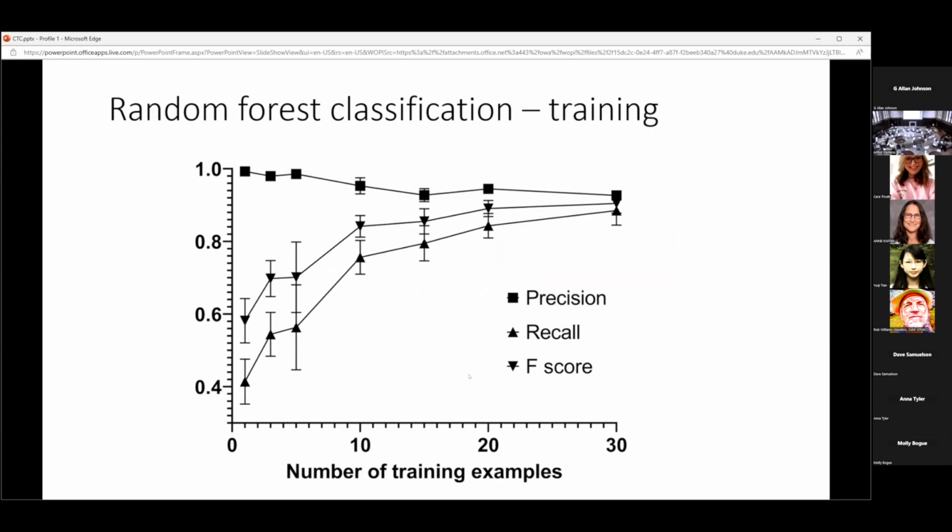As shown in this panel, when about 20 identified neurons are input to the training, the F score of the validation will be around 0.9, which is already quite high. So this step ensures our algorithm can be easily adapted to different regions and is translatable across regions and specimens.